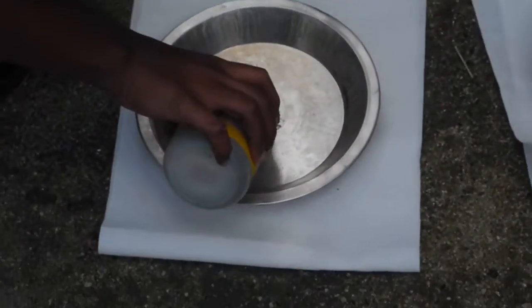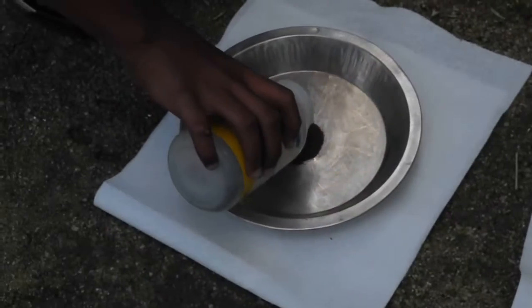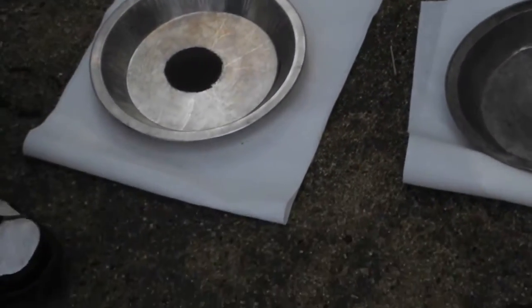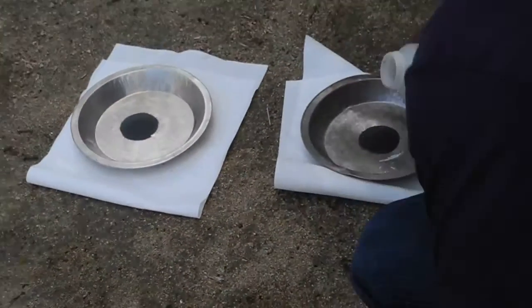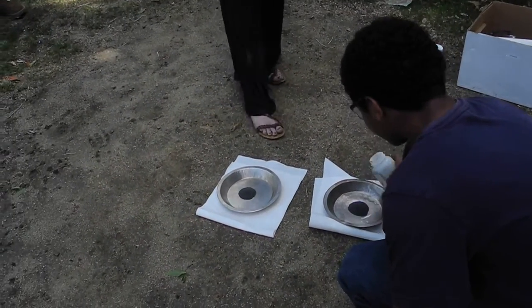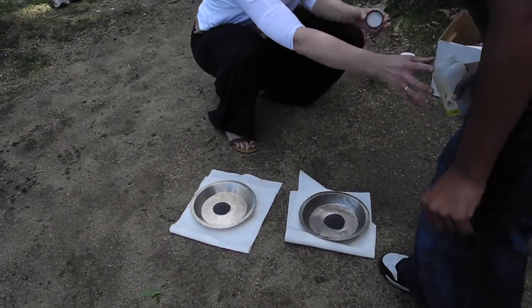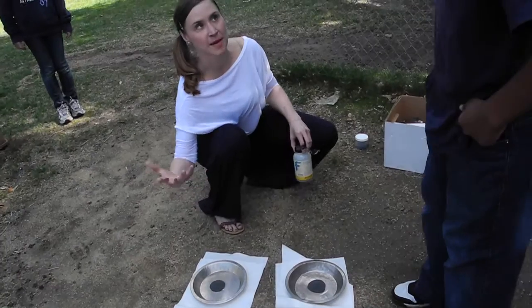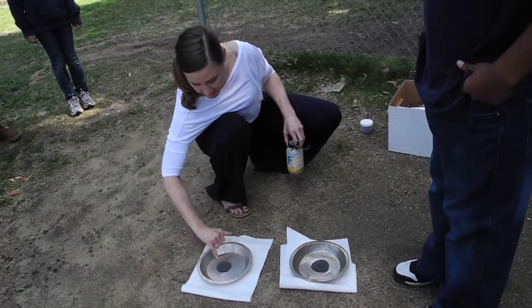Can we use the other chemical, like comparing which one acts faster? Yeah, that one too. And then I have one more thing for you to do on this. One of the things we noticed, if we have a spot essentially to pour the glycerin, it for some reason seemed to work out for us.